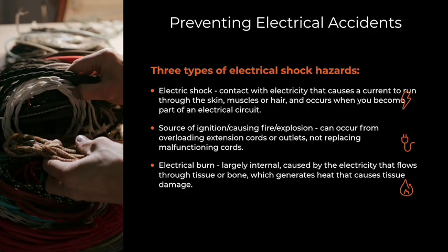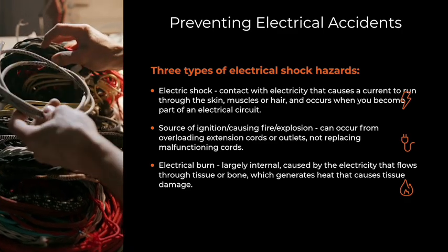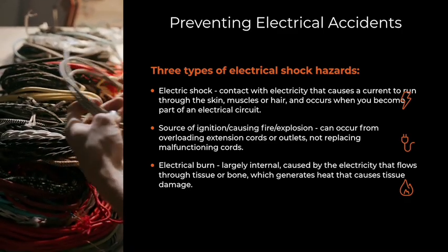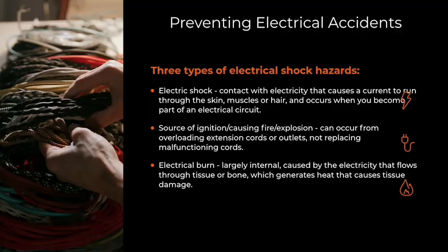Source of ignition, causing fire or explosion. This can occur from overloading extension cords or outlets, not replacing malfunctioning cords, or using damaged electrical equipment. Electrical burn. This is largely internal, caused by the electricity that flows through tissue or bone, which generates heat that causes tissue damage.